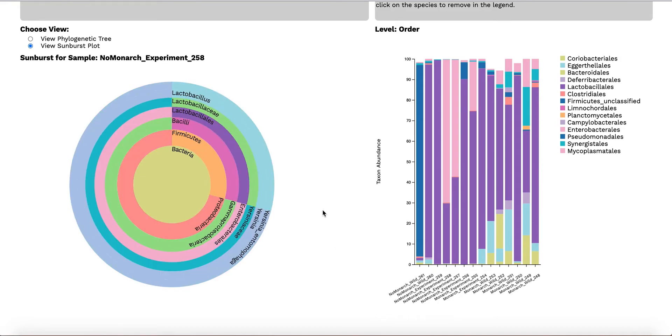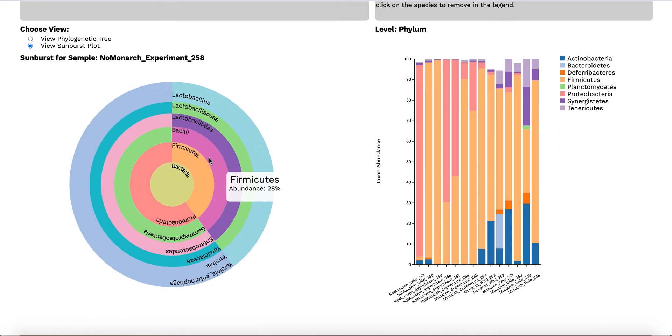For more information, you can hover over one of the rings which represents taxonomic level, or click on it.